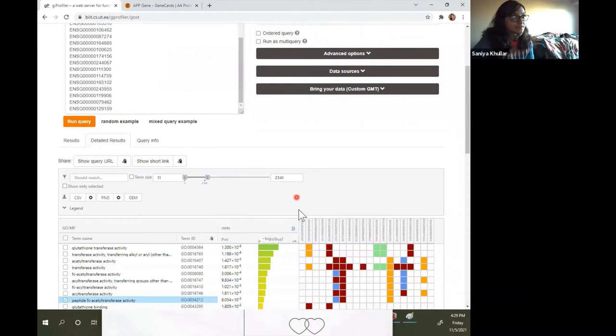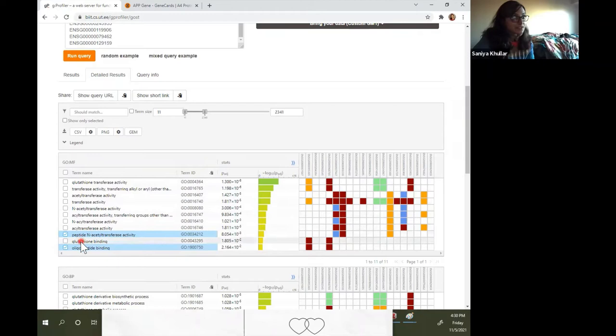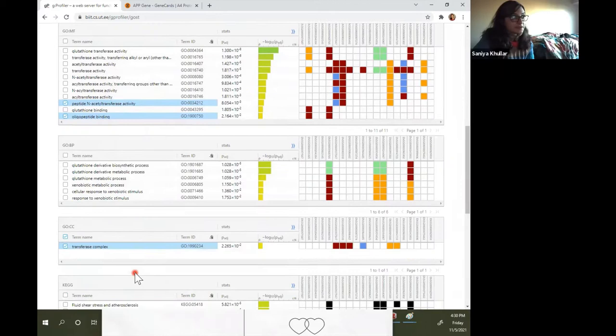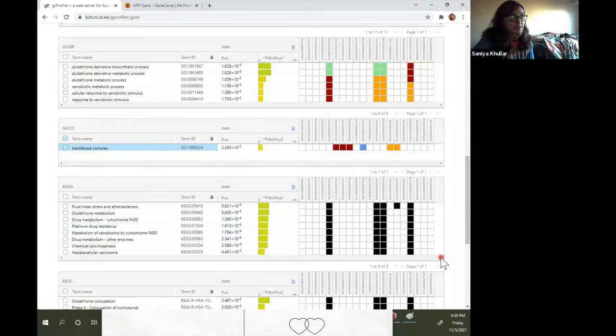If you look at the detailed results, you can see the molecular functions — there are 11 of those here. We should expect six biological processes. And for cellular components, we should only expect one, which is the transferase complex. So you can see that these are all the enrichments.